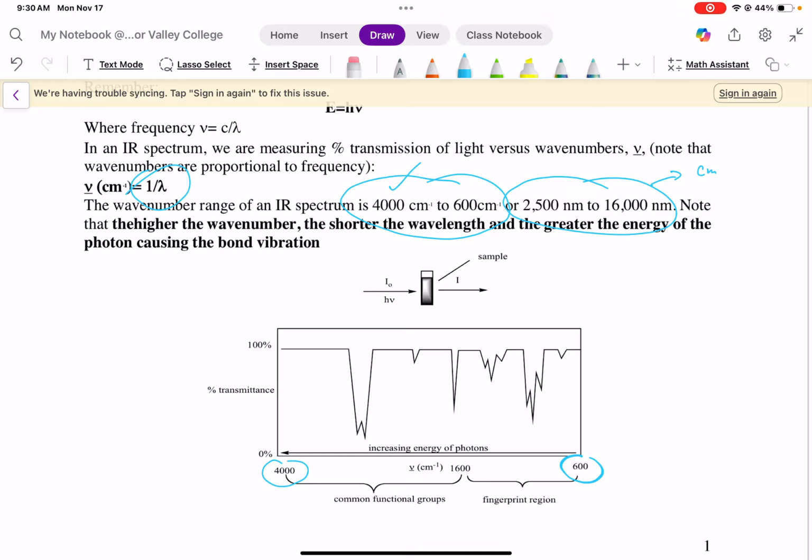Okay, so when you have a sample, when you have your compound, you put it in either 100% or with solutions. Usually we do 100%. We put it on the plate, and then you put it on the IR machine, and then the IR machine will hit it with IR with certain intensity, and then the sample will absorb some and then release the rest.